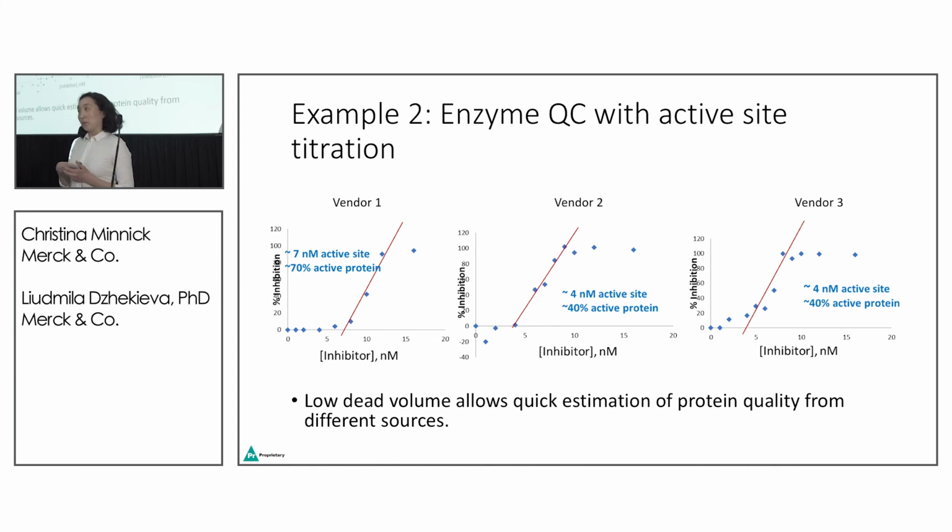For example, if you know all the concentrations, it can pre-populate what volumes you need to use. It also tells you what concentrations you need to prepare your stock solutions. Also, you don't have to worry about buffer or bulk volume because it pre-populates that too. So that saves lots of time with math.